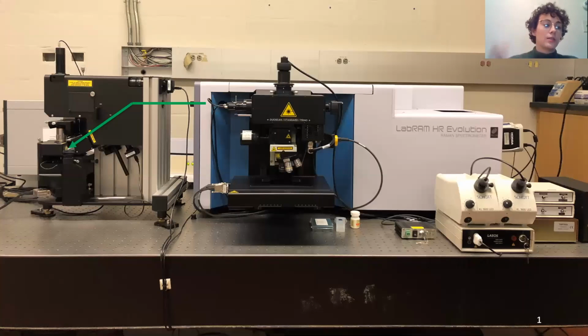In order to do this, you have to focus the laser onto the AFM tip, which causes a local enhancement of the electric field, resulting in a near-field Raman scattering. This is really cool because once you subtract out the far-field scattering, what you're left with is a Raman image that has a spatial resolution that's well beyond the diffraction limit. And then you can couple this to the topographical information that you're already collecting using AFM. This is an emerging technique that has been gaining a lot of traction lately, with applications ranging from 2D materials up to biological samples.